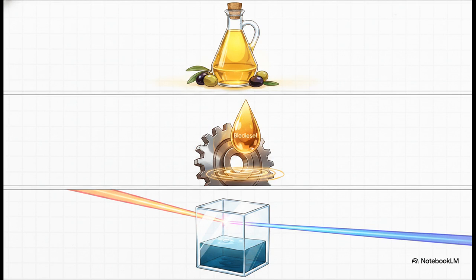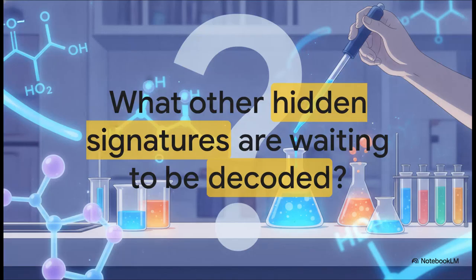By cross-referencing an oil's iodine value with its optical refractive index using advanced regression formulas, analysts can instantly spot if cheap oils have been illegally mixed into premium products. We've gone from the macro down to the molecular, exploring how the elegant, fundamental chemistry of the WIJS method provides essential data about the quality and industrial suitability of our fats and oils.